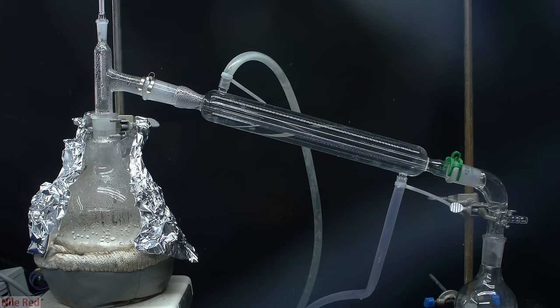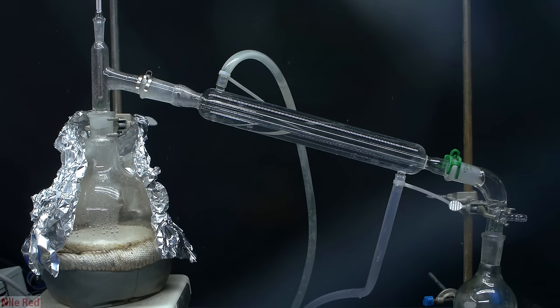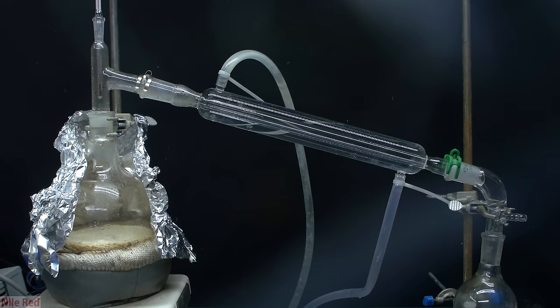If we look at the walls of the flask, we can still see a lot of water condensing on it. As time passes though, and we continue with the distillation, we can see the amount of water on the walls decreases until eventually it's all gone. As the water slowly disappears, the vapor and the condensate gradually take on a yellow color. Eventually, the walls of the flask will be pretty much free of any water condensation and will be condensing a faintly yellow liquid.